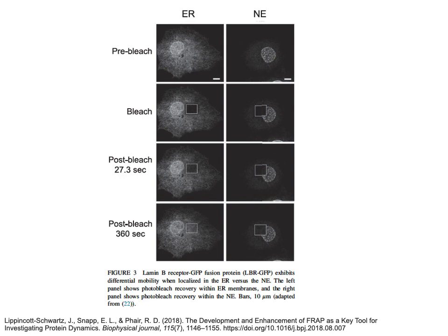Now comparing that to the nuclear envelope, we don't see that recovery occurring even at that longer time point. So this would show that the proteins in the nuclear envelope do not move as easily, so they're more anchored in position. If we think about the membranes of the nucleus, you're going to have all those nuclear pores in them, and so it's not going to be the same dynamic as we would see in the ER. And so this means that there would be a longer recovery time.